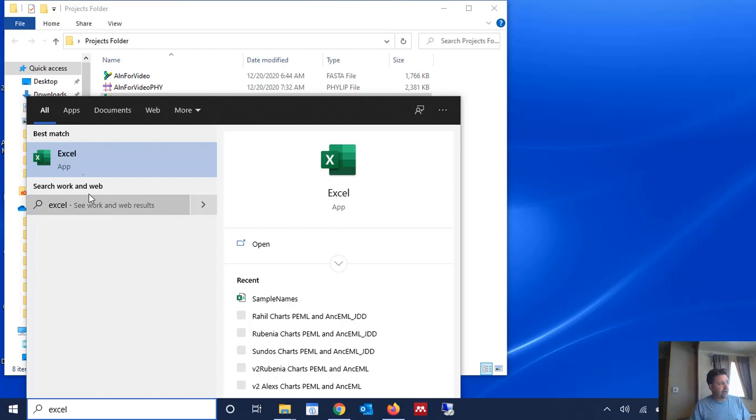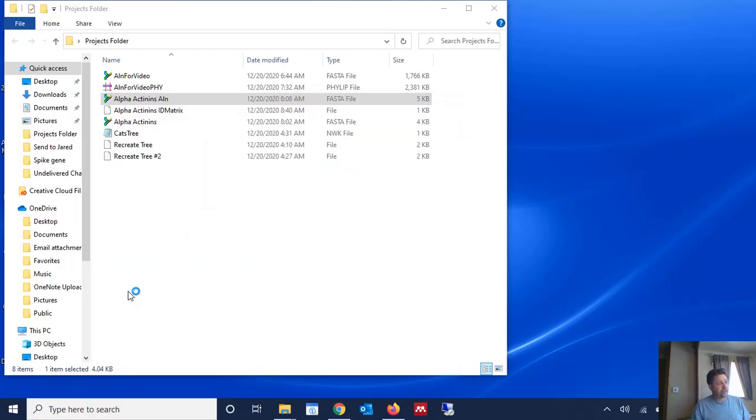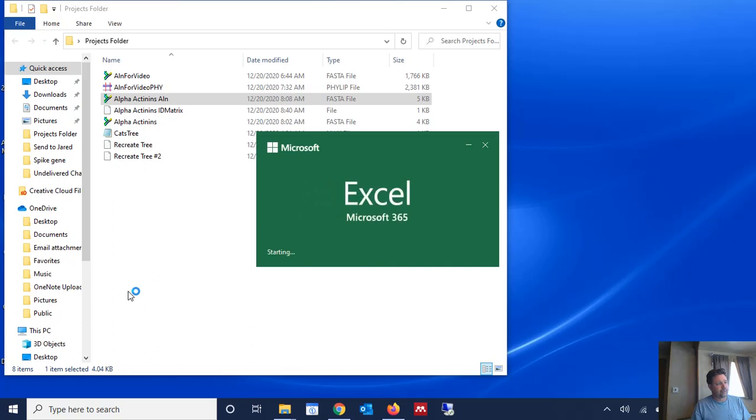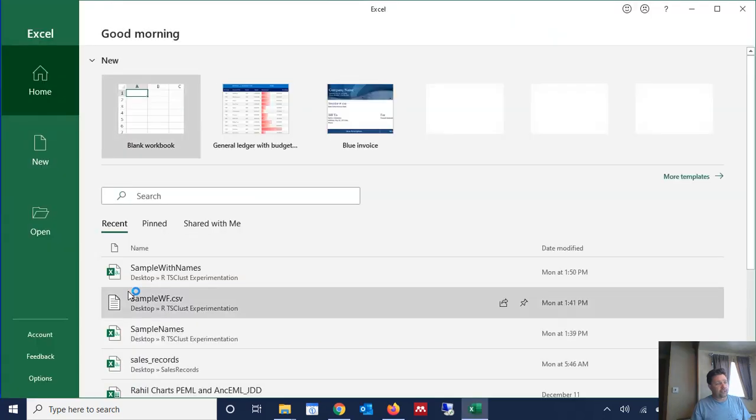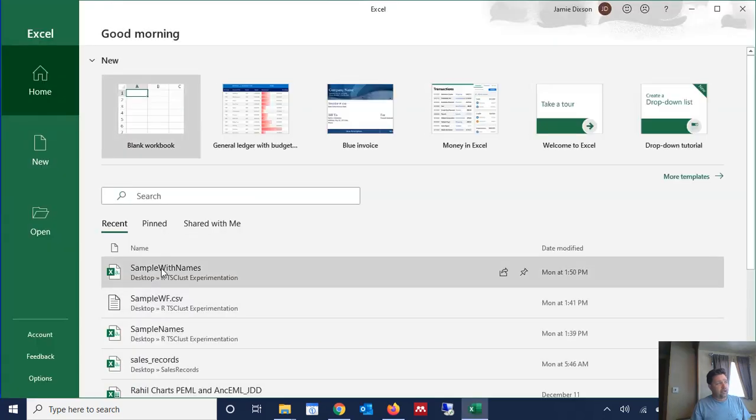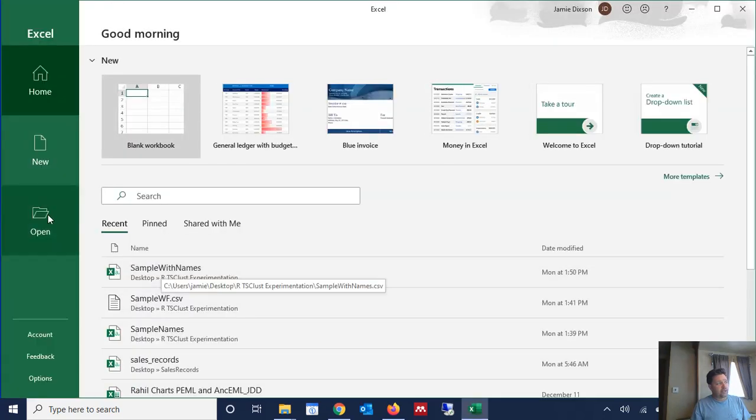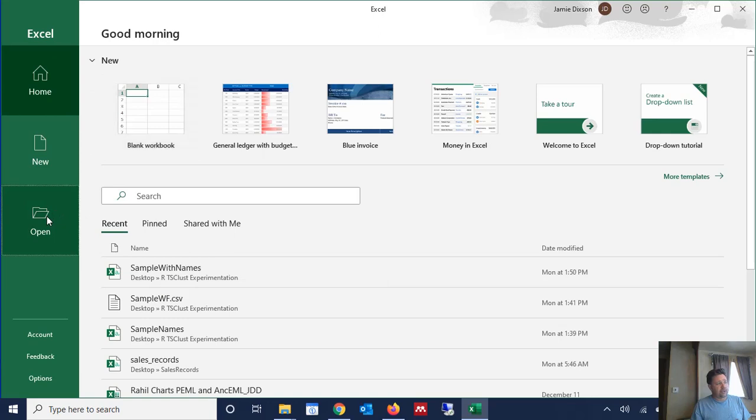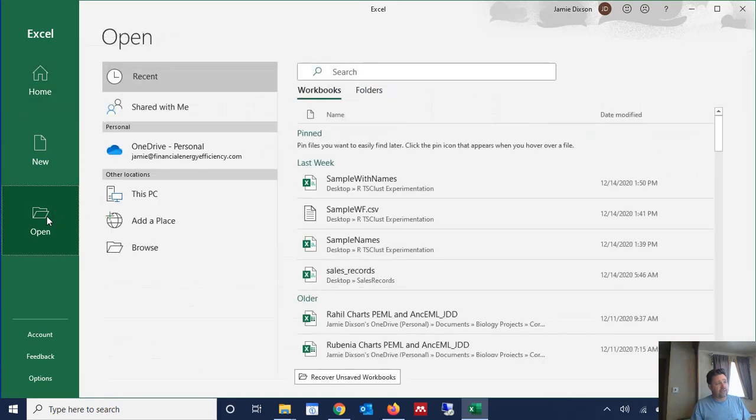We don't want to go to the file and open the file first, we want to open Excel first. And once Excel opens, then we're going to go to file and open and we're going to browse to that particular file that has the identity matrix within it and we're going to open it.